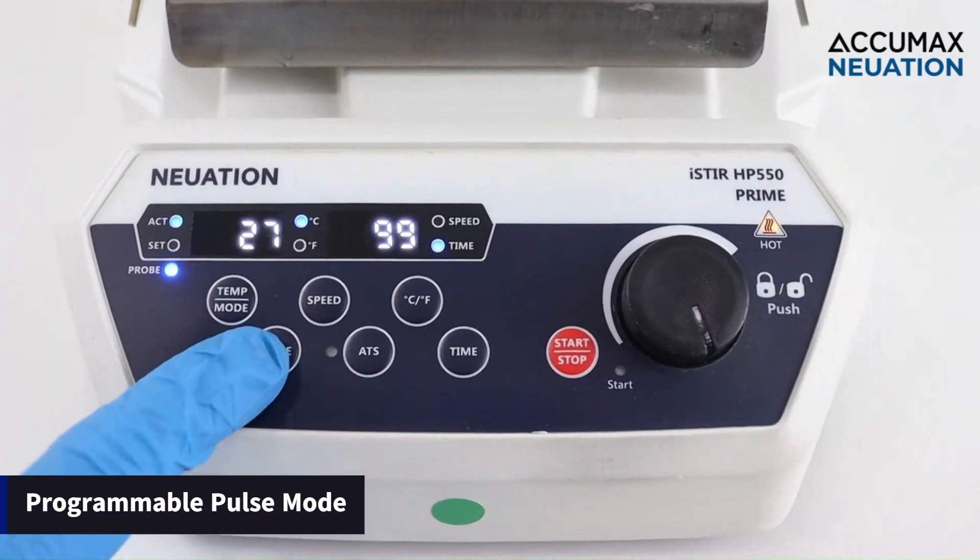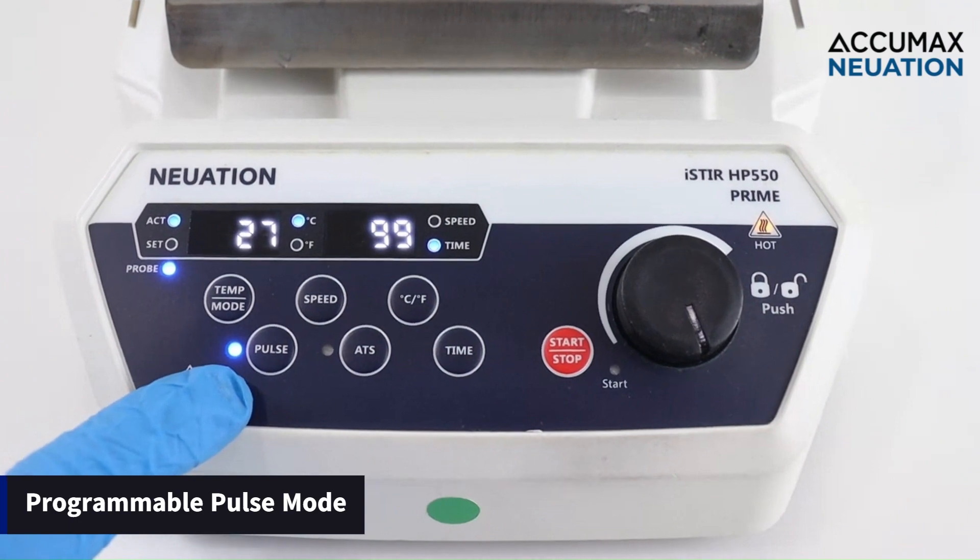The Pulse mode allows reversing the stirring motion at programmable intervals for thorough mixing.